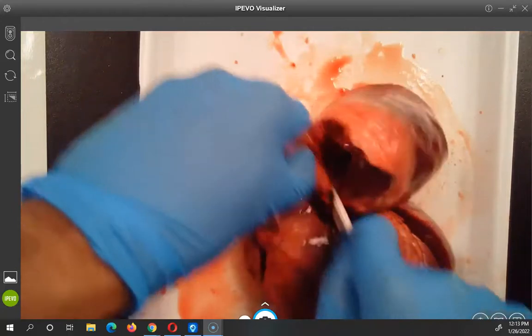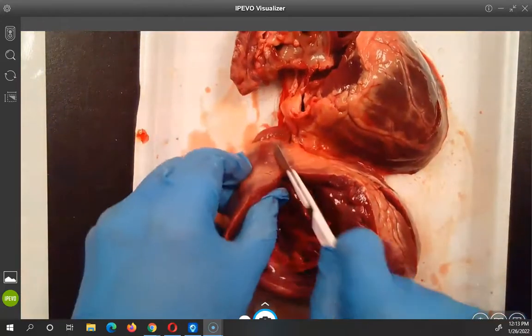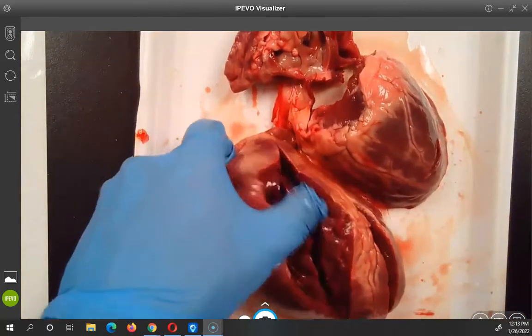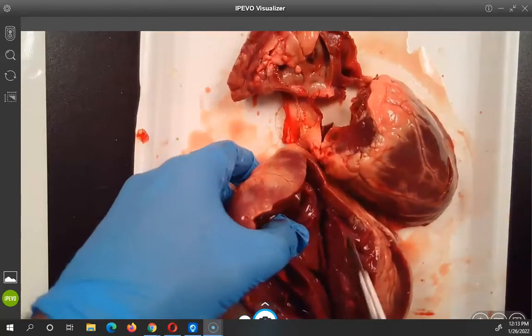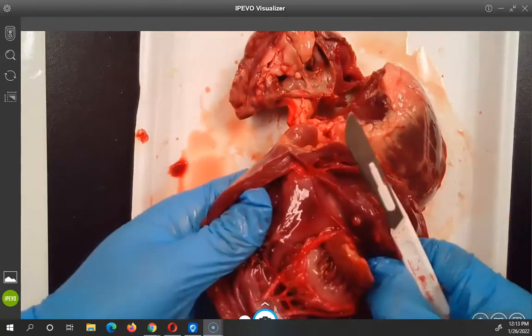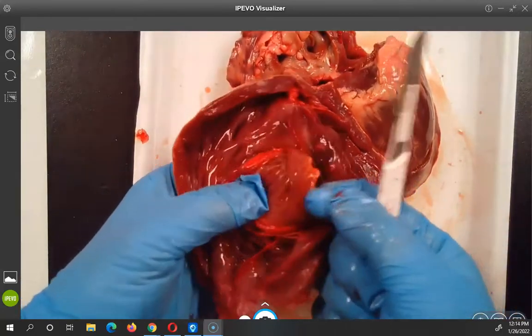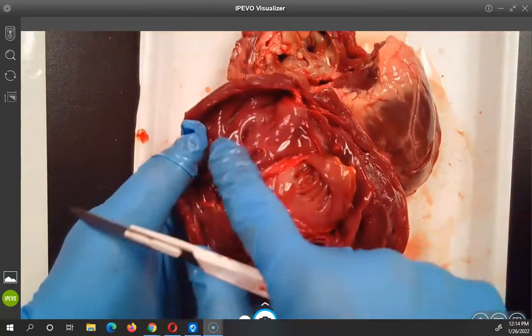Have you ever done this before? No, I've never dissected a heart. Makes sense why you're cutting it up — yeah, I just want to see everything that's in there. It's cool. It looks like you're cutting it up — see, you're so scared. It's got little veins inside.